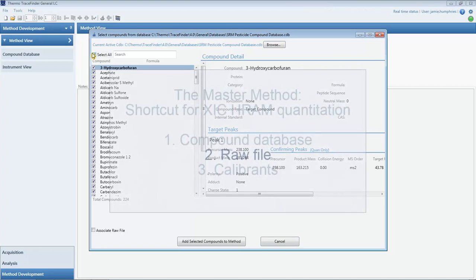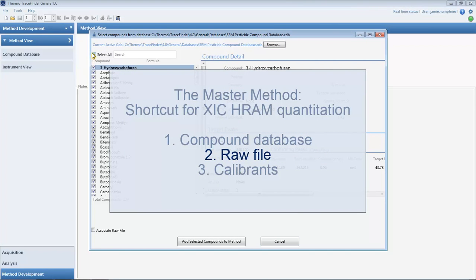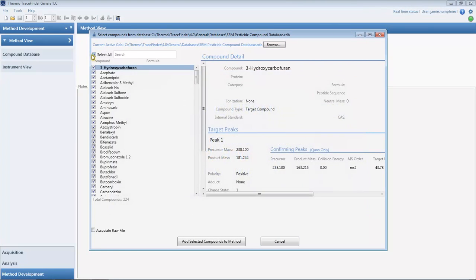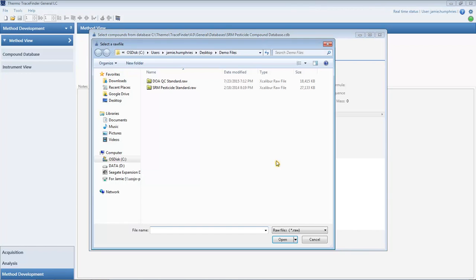Next, import a raw file. We select one that has the retention times, peak shapes, and scan filters that will be processed with this method in the future.